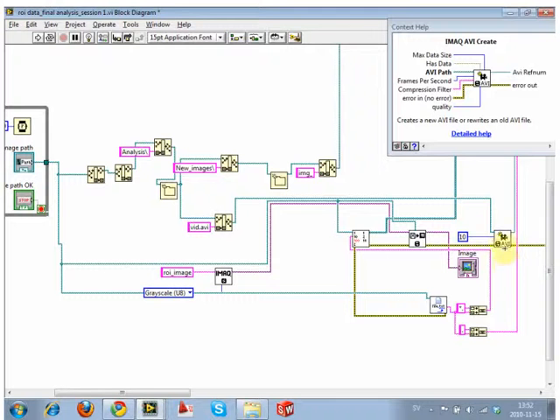When you're saving files, so if we're saving images, for example, we just save the image. It's a very simple one piecewise operation. A video you can think of more like a zip file for images. You have to make a zip file, then you have to stick the images in, then you have to close the zip file.